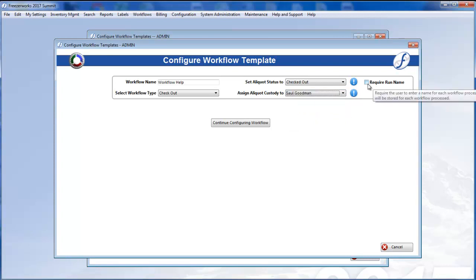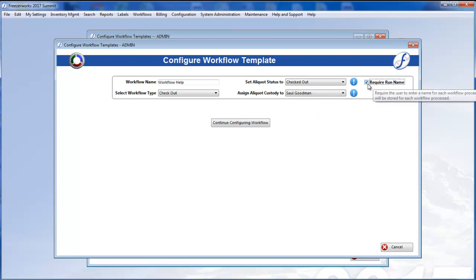Finally, the Require Run Name checkbox, when selected, will force users to provide a name whenever they process this workflow. This name will end up on the View Workflow History record for the particular run of the workflow.